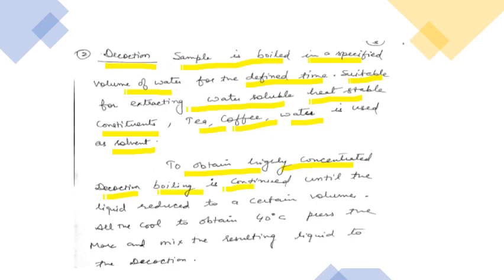And boiling should continue until your liquid reduced to a certain volume. Then we cool it to 40 degrees centigrade, press the marc, and mix the resulting liquid, which is called the decoction.